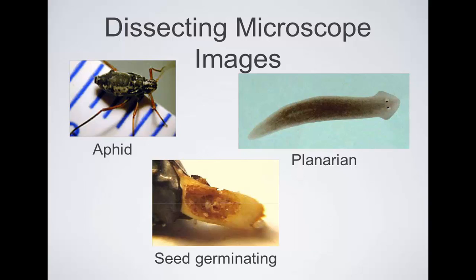So one question is, why does the dissecting microscope give us a much greater sense of depth versus the compound microscope? And the reason is because of the two eyepieces. Just take a little digression here. We see humans see pretty well three-dimensionally. We have good depth perception. Right? Some types of animals do not have good depth perception.